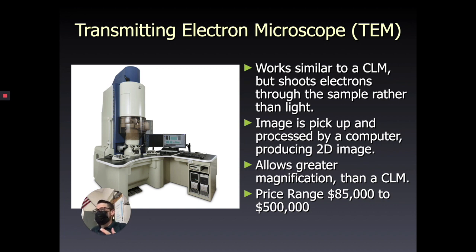Now, if you had a sample that you wanted to look at in very close detail, there are companies whose whole job is to operate electron microscopes. So you could send them your samples and say, hey, I want these images, and they will process the samples, get the images, upload them on a flash drive, and send it back to you.